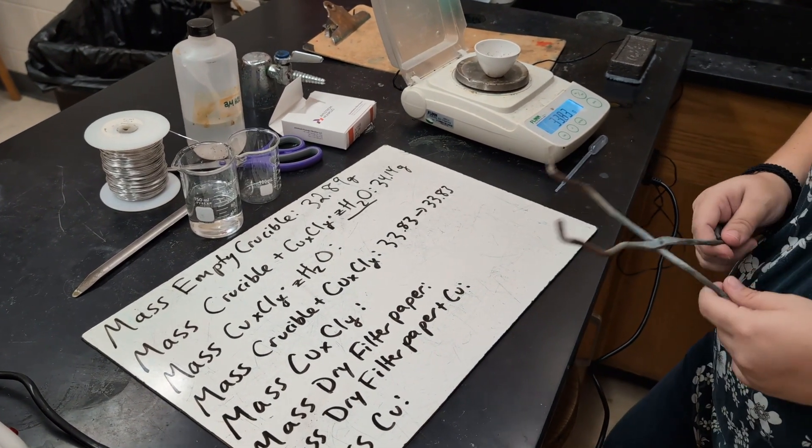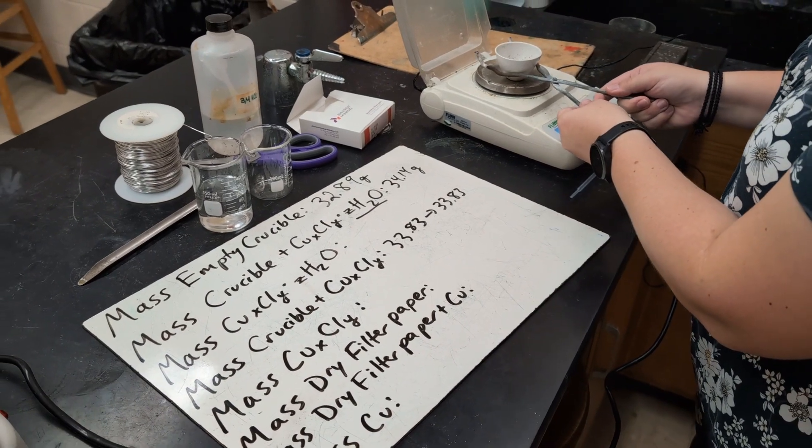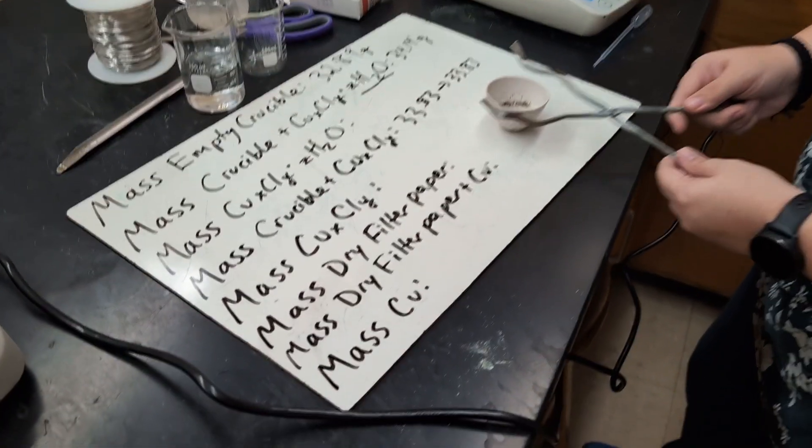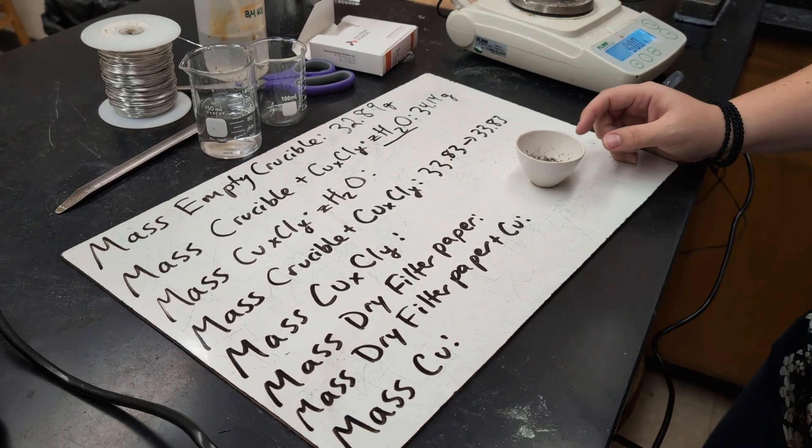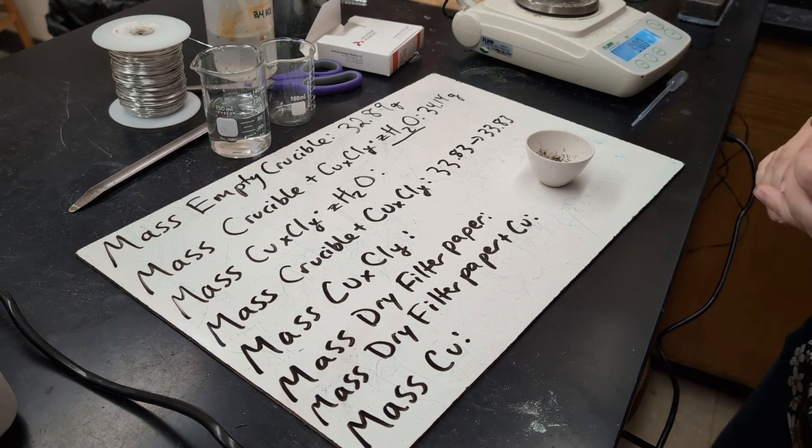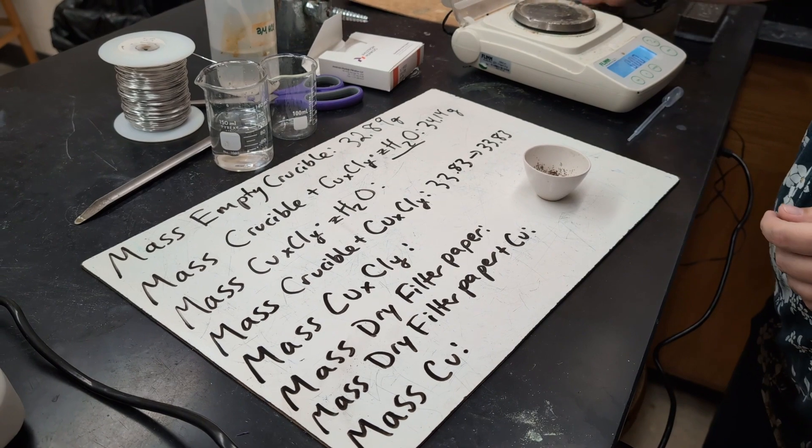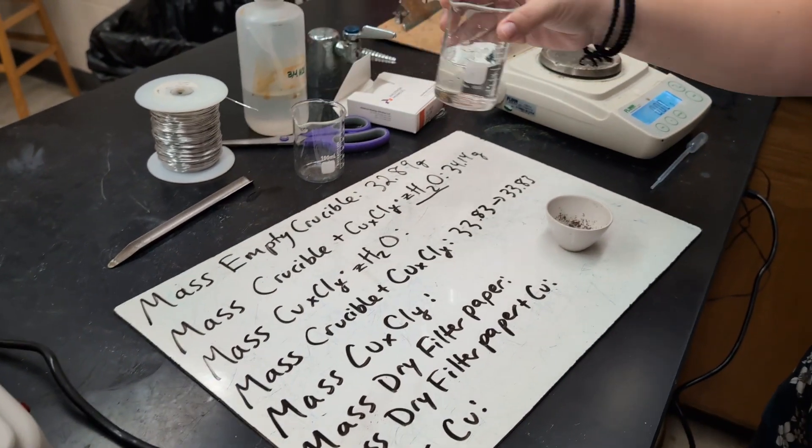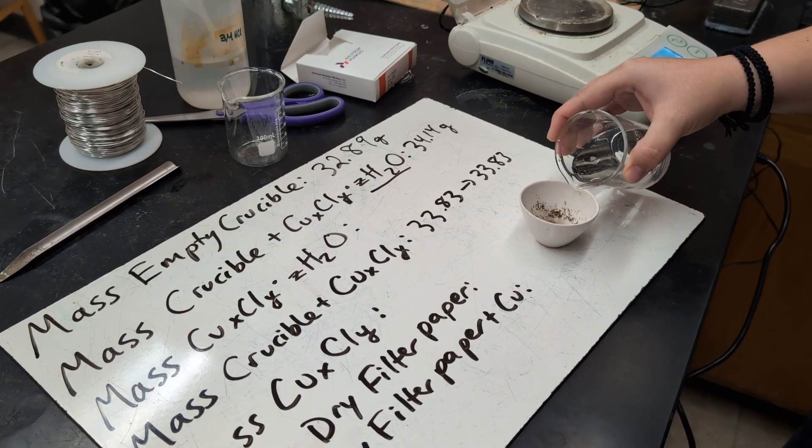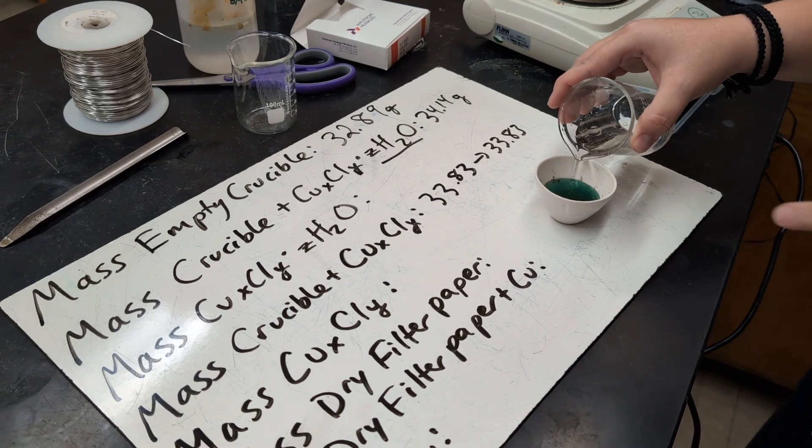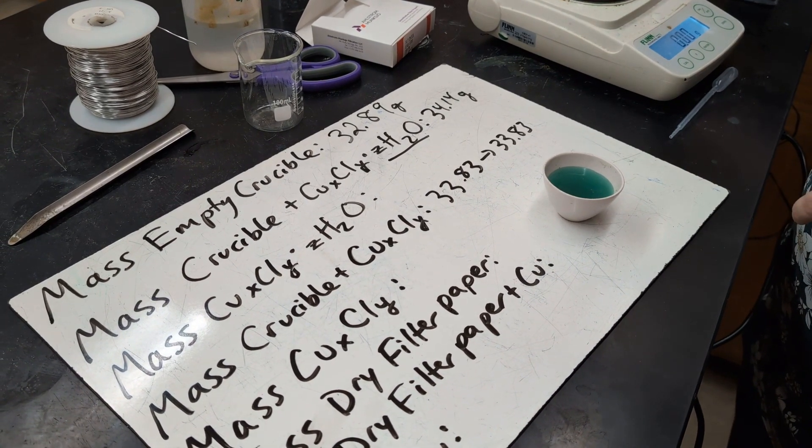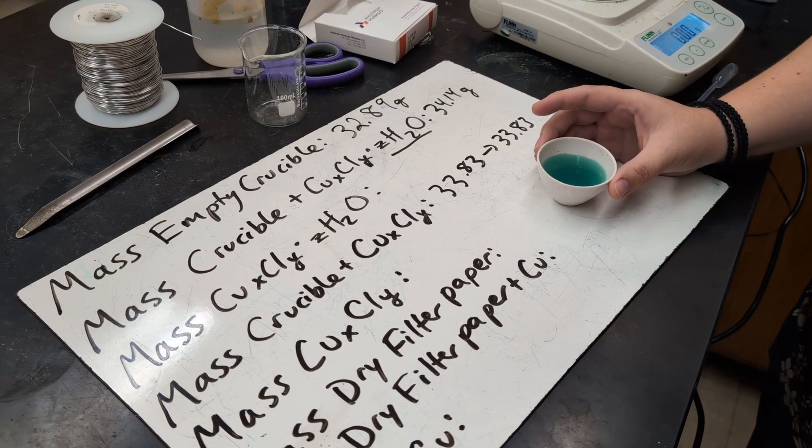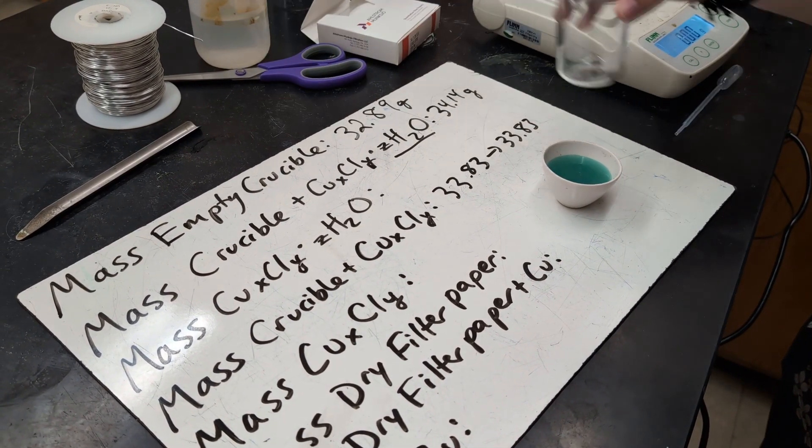So to accomplish that, our next step is to do the reaction. You need to make sure that your crucible is pretty well cooled down so you don't crack it. But then you're going to add some deionized water to the crucible. So I'm going to add that in slowly. It's going to rehydrate and turn back to this bluish-green color. And I'm going to transfer that to another beaker.